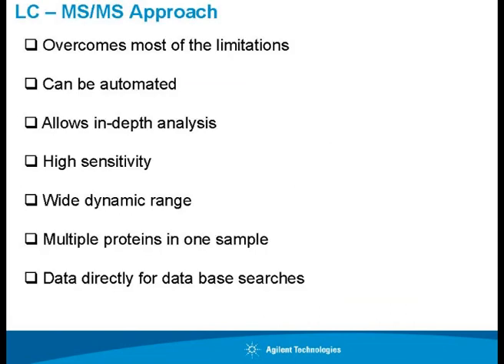So to overcome that, we follow the LC-MS approach, which reasonably addresses most of the challenges, okay. Basically, because it can be automated first. You can do multiple runs and you can automate it. You need not sit there and do it. You run overnight and in the morning at least you can compare results and see what is happening.